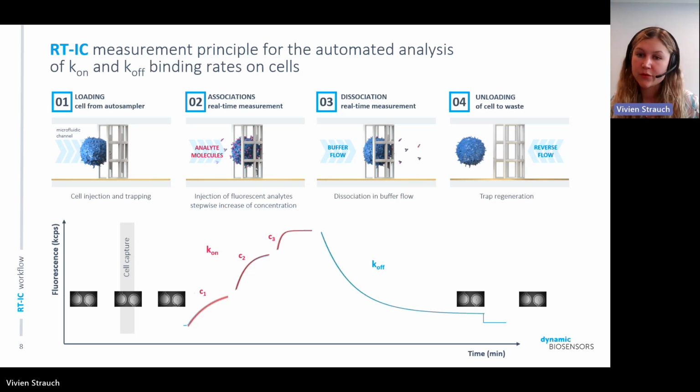Would that work for small molecules fluorescently labeled? Yes, definitely. We've already done so. If you have the strategy to label your small molecules, there's absolutely no reason that this shouldn't work.